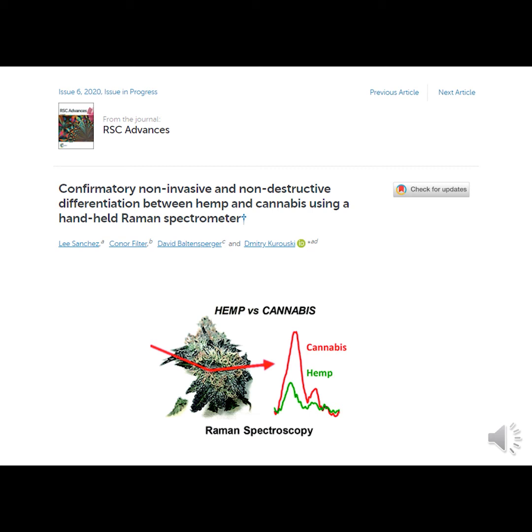It does it by really a technology that seems like science fiction, like a Star Trek tricorder, but it scans a plant material with light, and there are different molecules in the plant that absorb different wavelengths of the light, and these differences between a hemp plant and marijuana plant can provide different signatures of light scattering that they could detect whether a plant material is hemp or marijuana.